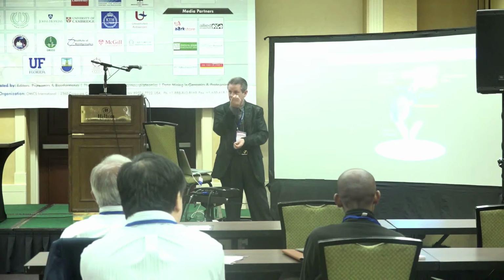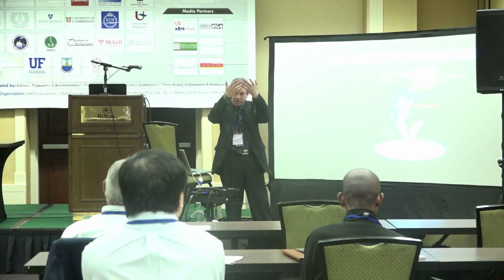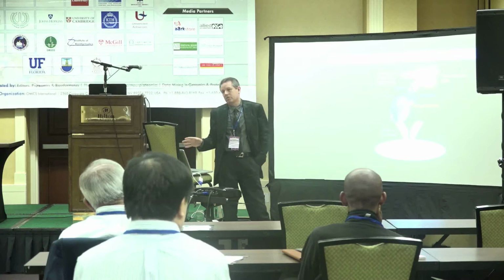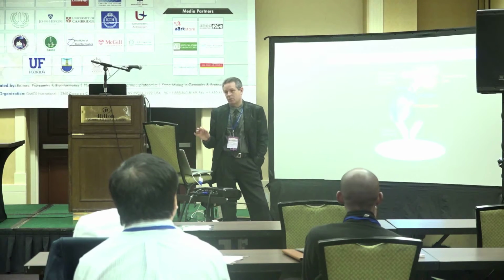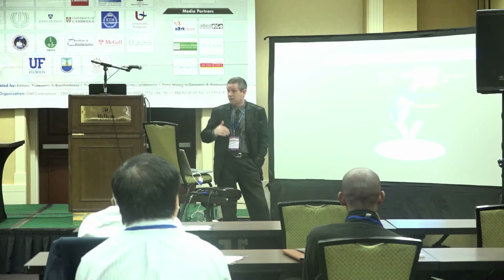So now we're getting multidimensional. Because it's the same array, we can use all the various formats, essentially detection systems, and start to multiplex the data for a particular antibody spot. So we're now talking about 7,000 measurements potentially, and we'll probably be going in a year to about a 950 antibody microarray. So we'll steadily increase that.